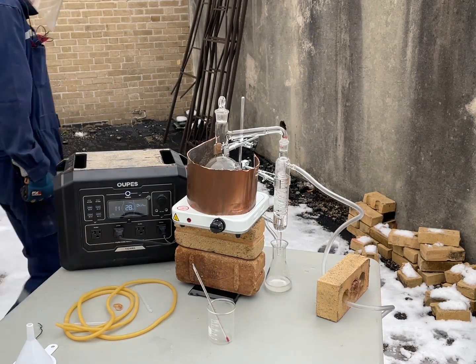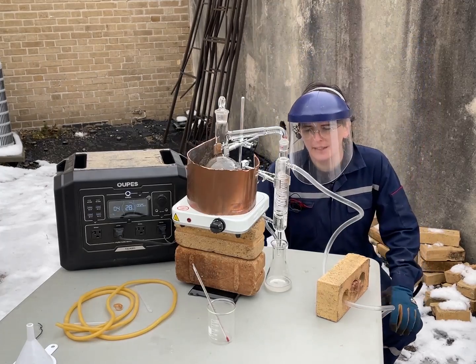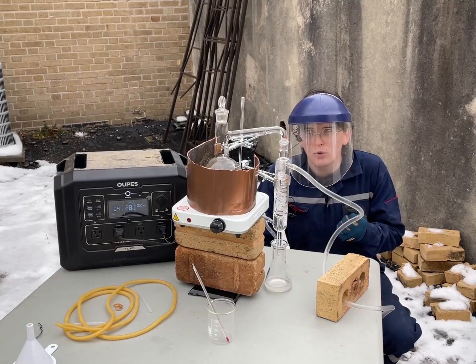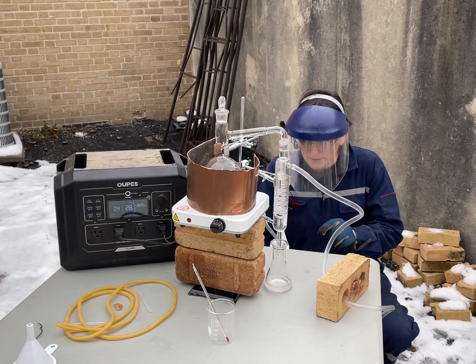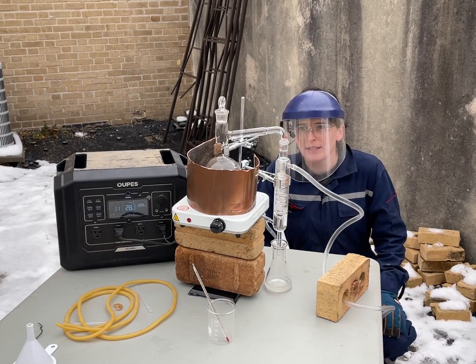So there we have it. We have distillation of flammable solvents. And we're definitely wasting a lot of energy with it being so cold out. It is really cold, and this requires a very high heat to distill. But this was the hardest one. Well, not the hardest one, but the hardest one I'm ever going to probably attempt.